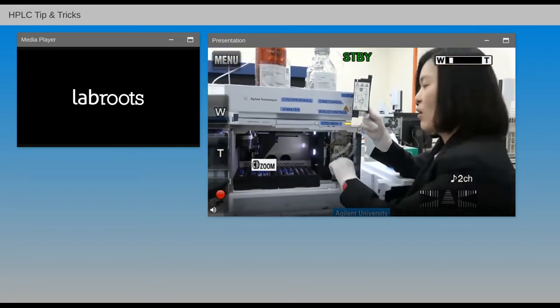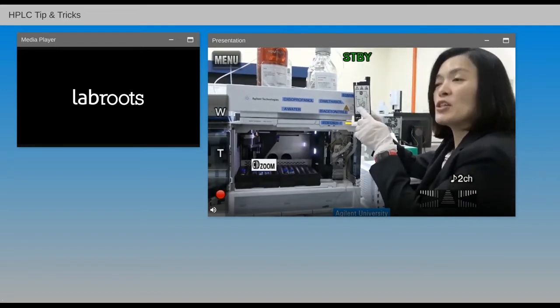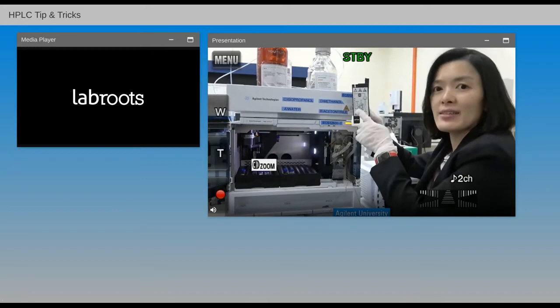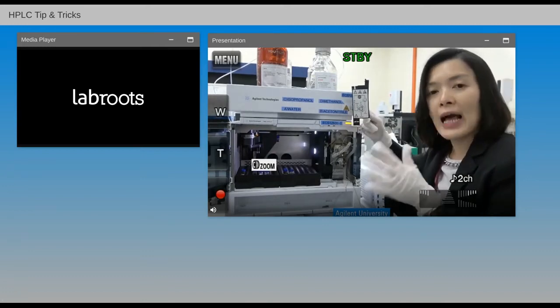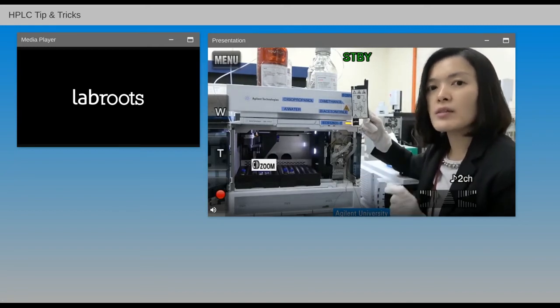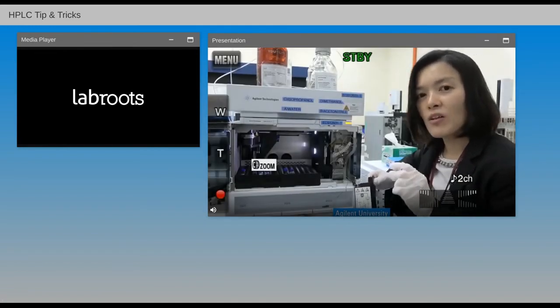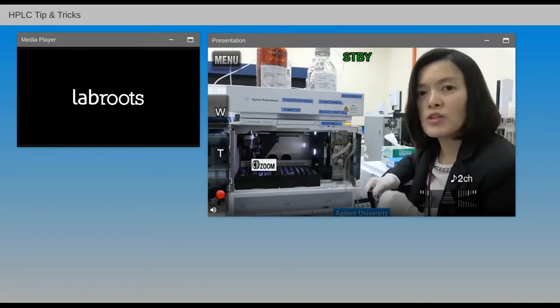So similarly, as I said, you can dismantle the last one, 5. If the pressure drops, it means it's not due to the upper part here. But if the pressure still maintains the same, it could be that the needle is choked. Yeah, this is how you can try to find out which part of the auto sampler causes the high back pressure. What I've shared earlier is mainly by testing on removing the nuts from each of the ports.